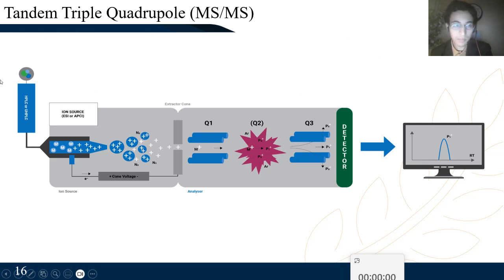So here is an example of a triple quadrupole tandem mass spectrometry. Here you have the inlet sample, which remember, you can have as a liquid or gas phase, but the liquid needs to turn into a gas phase, because you cannot enter anything into the mass analyzer except gas. It deals in ion gases, where the gases are ionized, and it only plays around with this gas state.